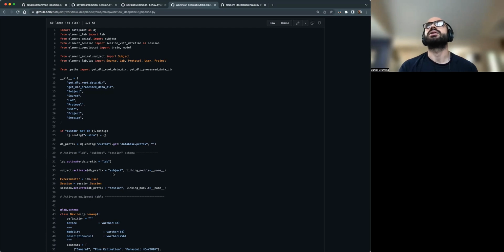To improve my broader understanding, is this something that would be permanently attached to the database, or something that gets activated by a single user when they want to use it? And if that is a no, is there a way to permanently attach it to an existing database?